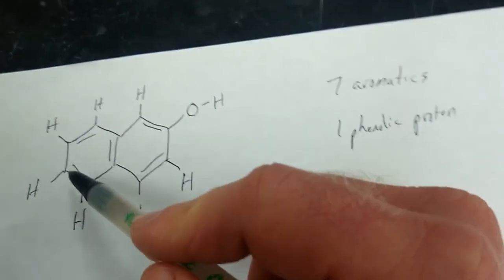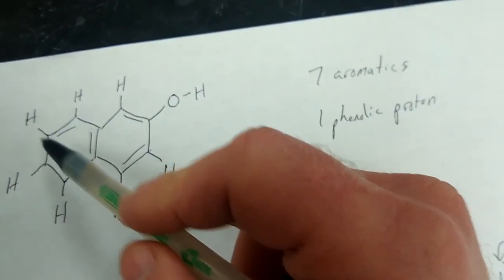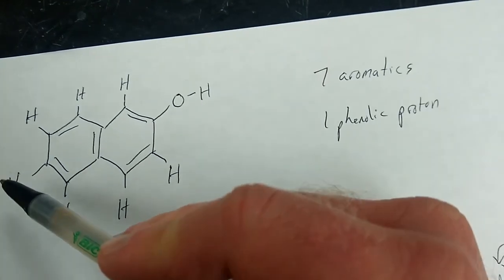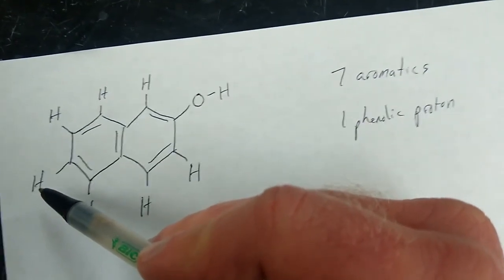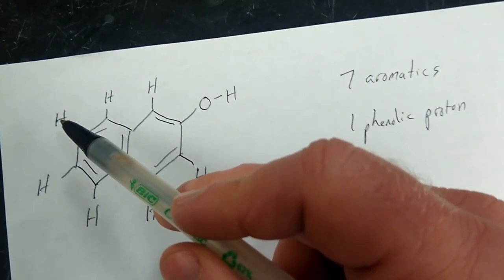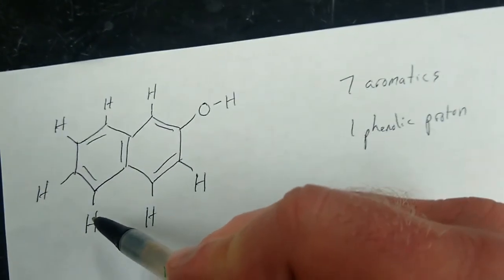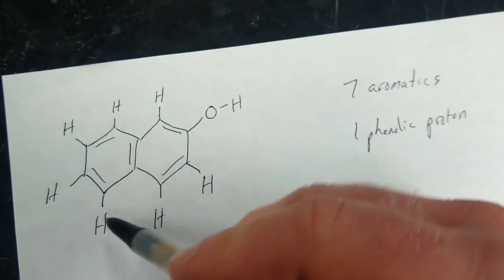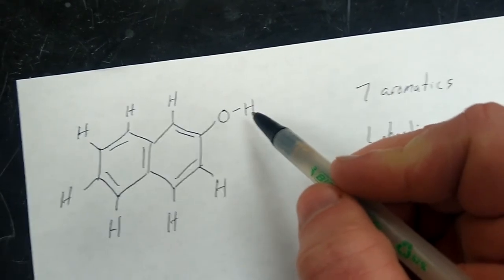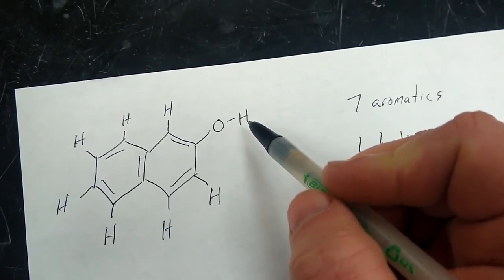For example, this one, it's got one proton on this side, one proton on that side, so two plus one, that means this signal should be a triplet. This one has two neighbors, so that should be a triplet. One neighbor, so it should be a doublet, and so on. And then of course your OH has zero neighbors, and that's why that's a singlet.